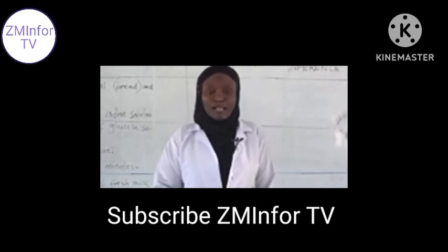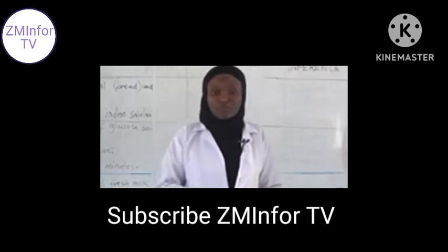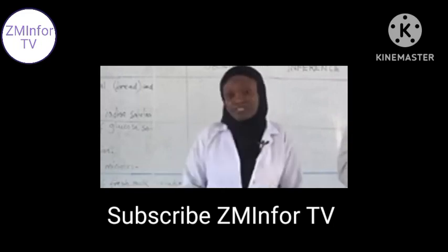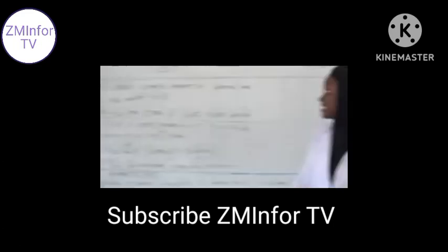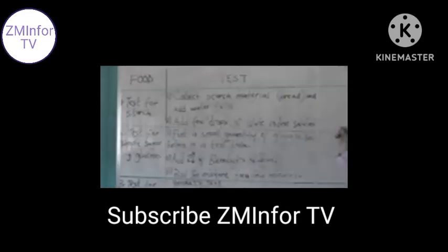This will help you as we go along with our subsequent practicals. For now, we are going to take the food test, and on the board we have the table for what we are going to test. The first column is the test for starch. We are supposed to collect any starch material.